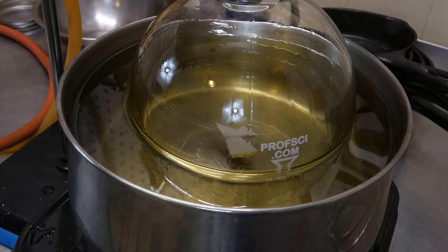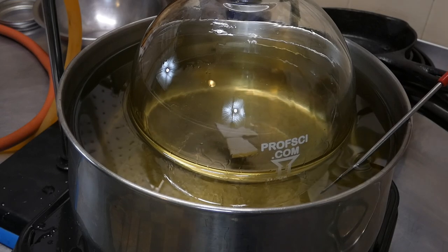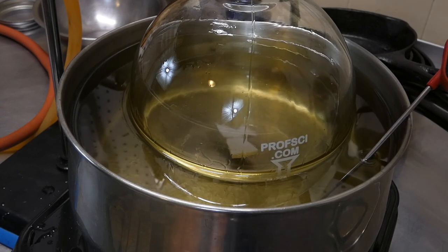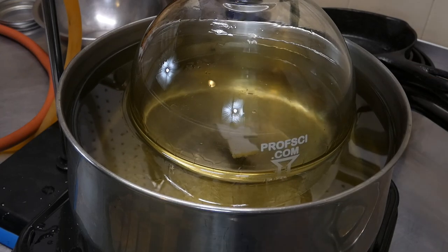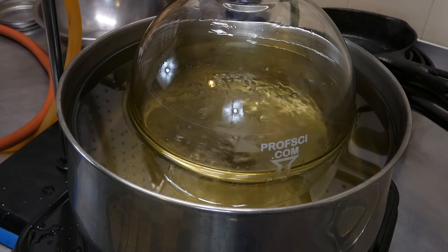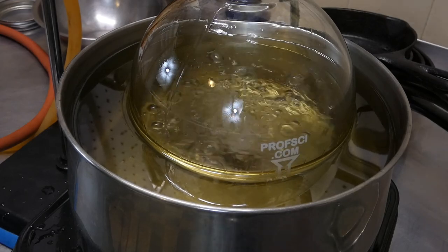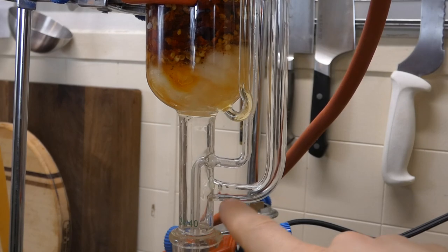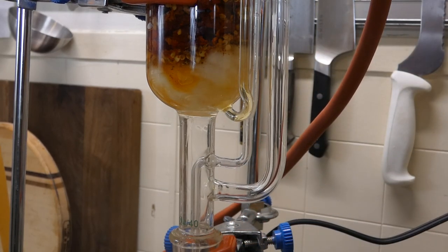All right, little bubbles are starting to form in the flask there. The oil is at 240 degrees about. I'm gonna just turn it down just a hair and wait until that comes to a boil. Any second now, it's gonna start boiling pretty decently. All right, and it's at a boil. As you can see, those boiling stones keep it under control pretty well. So as you can see, vapors are starting to steam up through here, which is good.